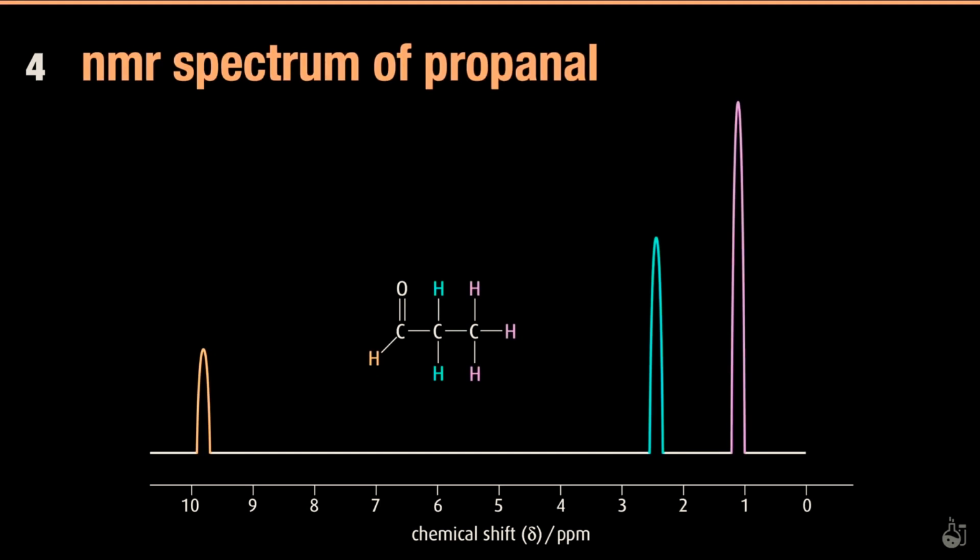I'm talking right now about slides 5, 6, 7, 8, but it's a big graph, so I've left it here. First of all, in slide 5, how many peaks are there? There are 3 peaks, and the 3 peaks correspond to 3 different chemical environments of the protons. The term proton will be used to refer to the nucleus of a hydrogen atom, but you can consider that when I say proton, I'm talking about hydrogen. So we talk about the hydrogen's environment, but technically I should say proton environment, though I'm really talking about hydrogen's environment.